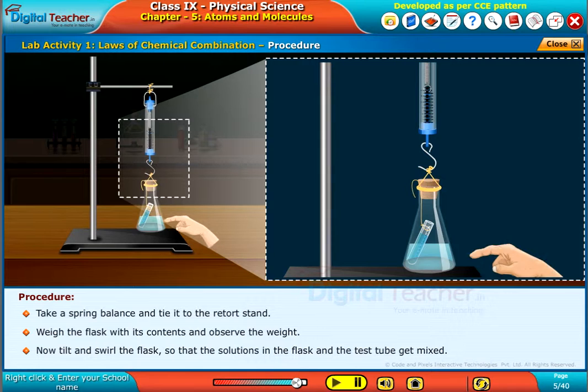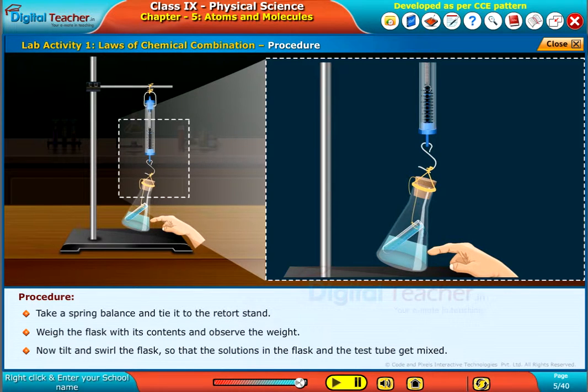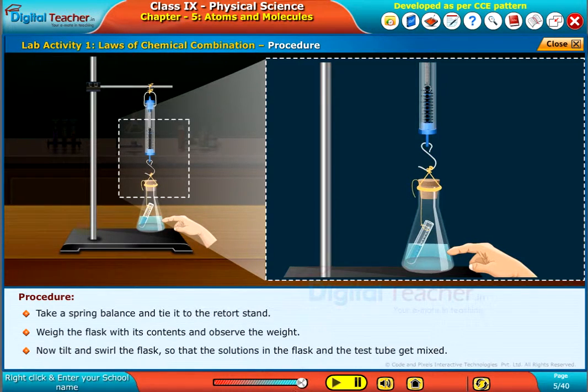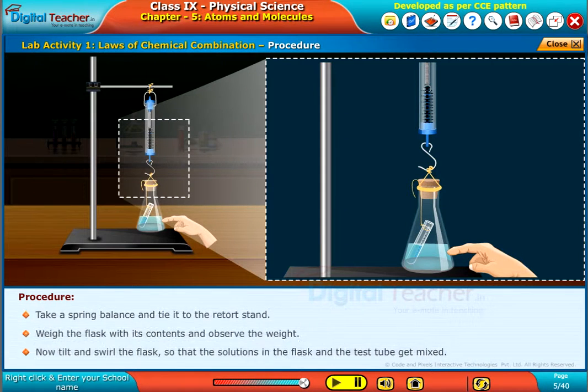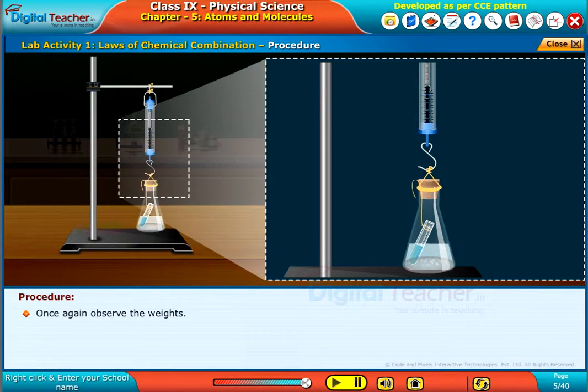Now tilt and swirl the flask so that the solutions in the flask and the test tube get mixed. Once again observe the weights.